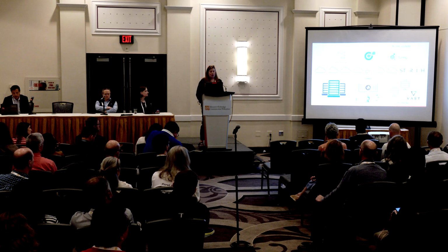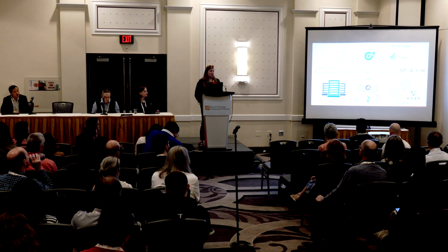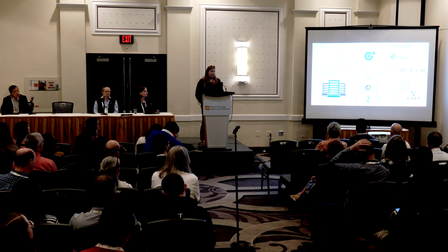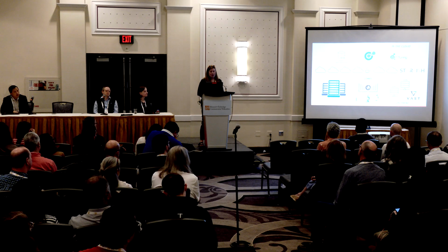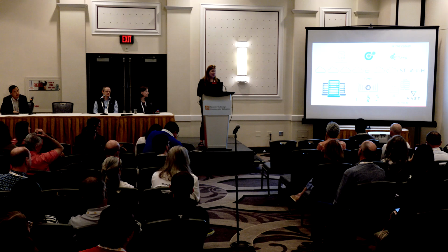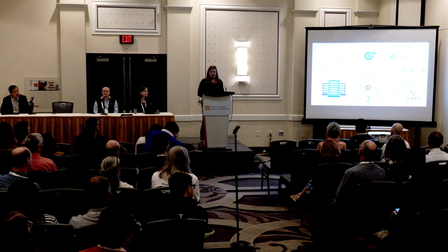We're starting to use a tool called Zero that was developed at the Fred Hutch to do data management, but also empower users to run their own bioinformatics analysis, as we have limited resources, and to give them reproducible pipelines that they can run at the push of a button instead of having to learn command line and programming languages. And then we're also using BioTuring, which is similar, but only for single cell and spatial data.